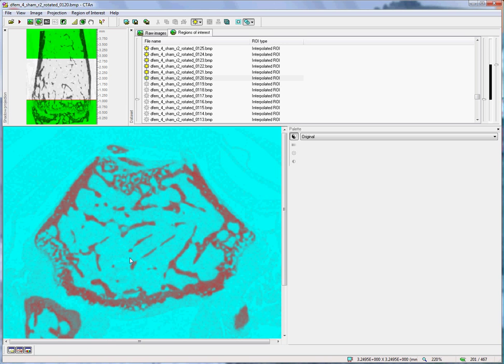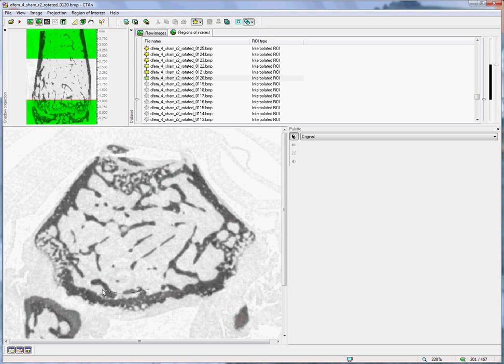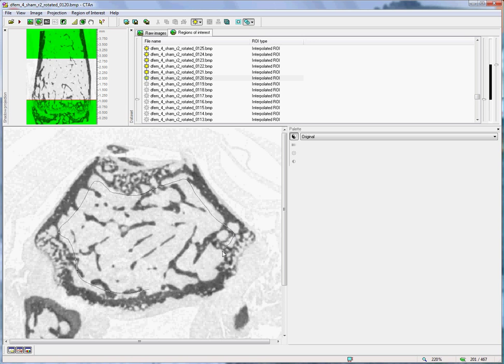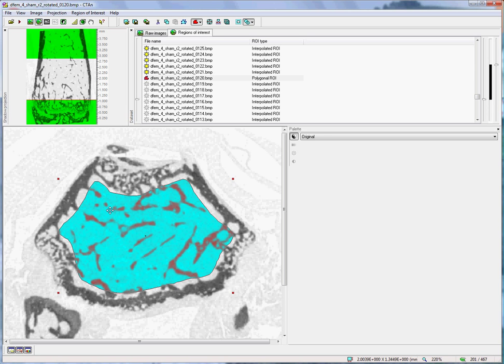And I start drawing these shapes with the left mouse button running parallel to, but a little way away from, the endocortical boundary and avoiding these vestiges of the growth plate, which still exist at the corners. So I draw my level like this.